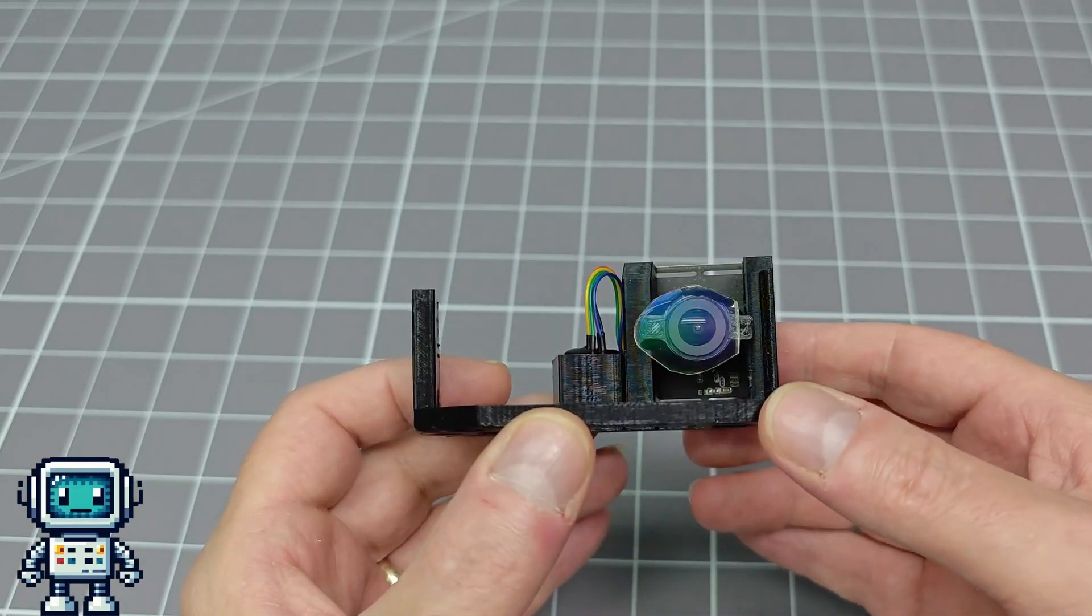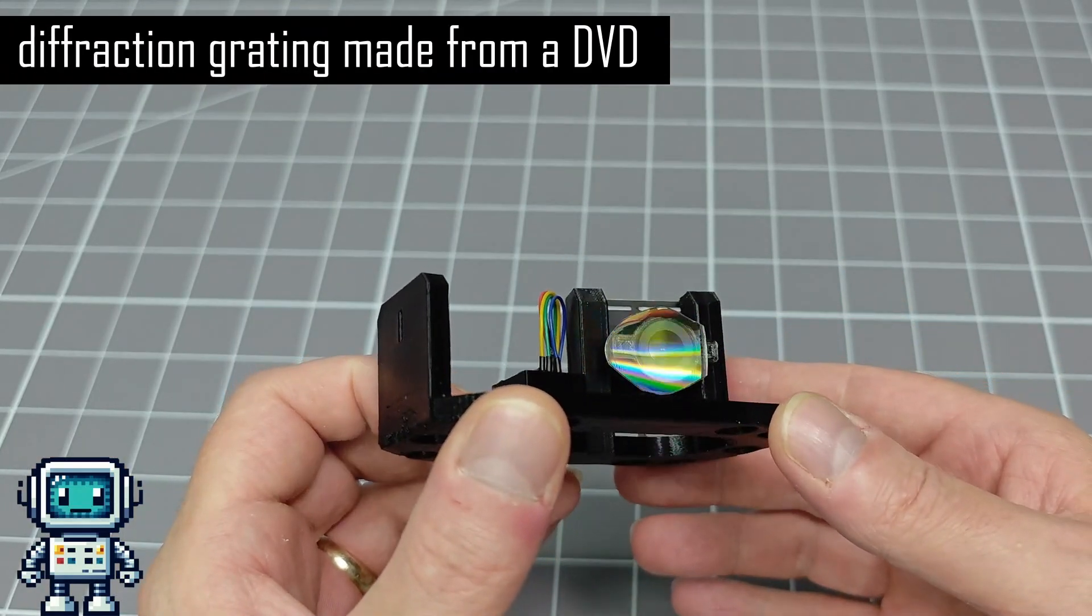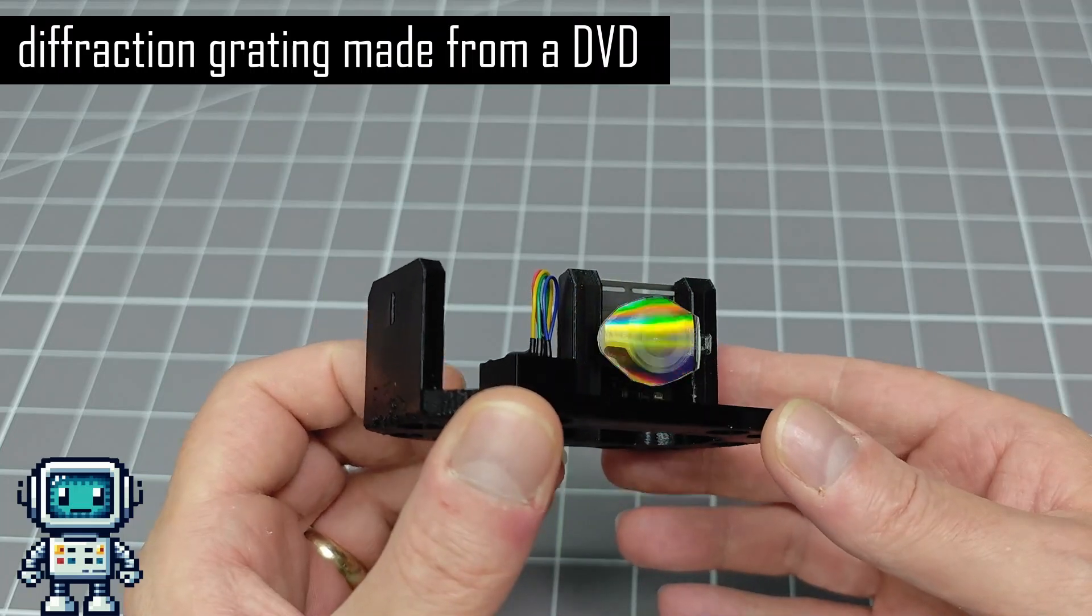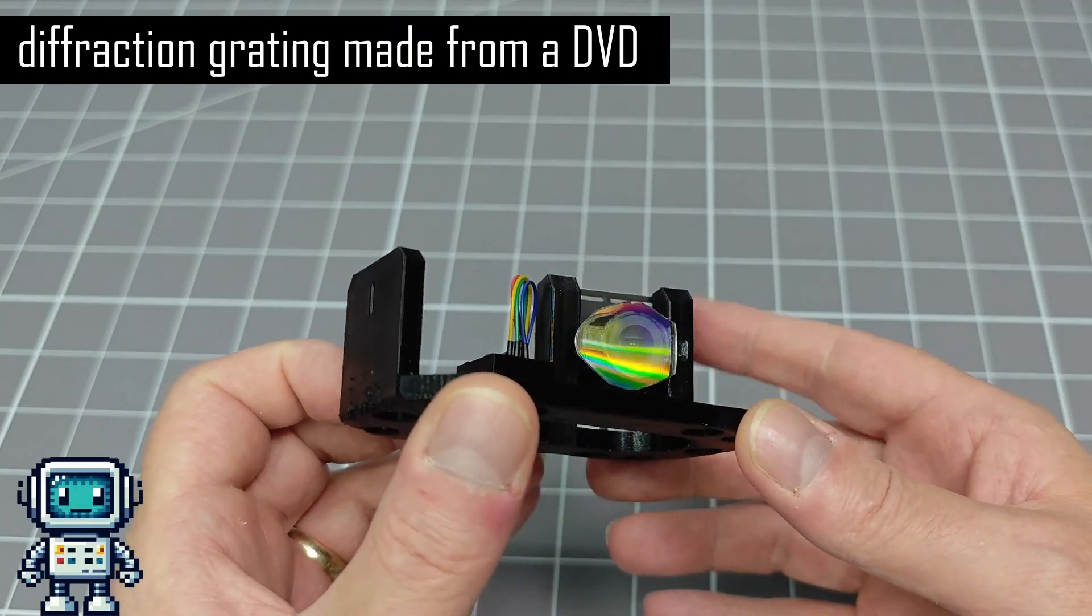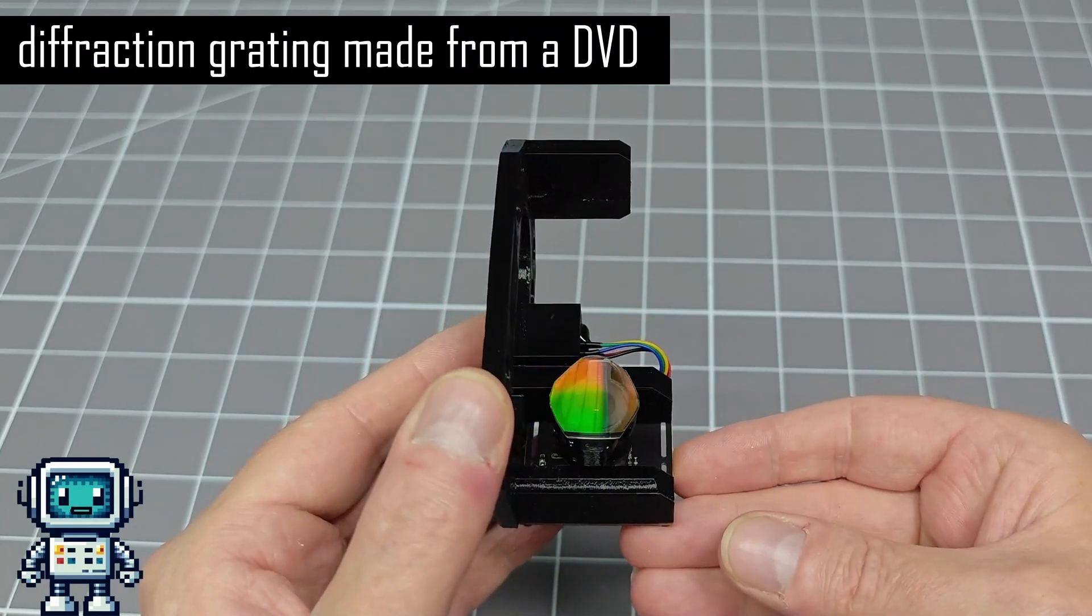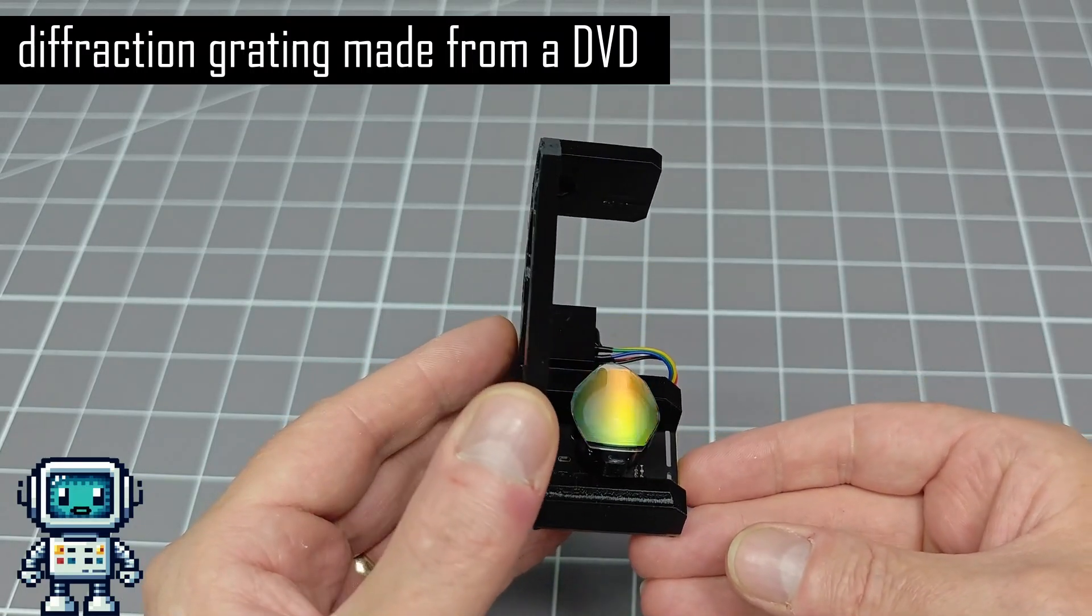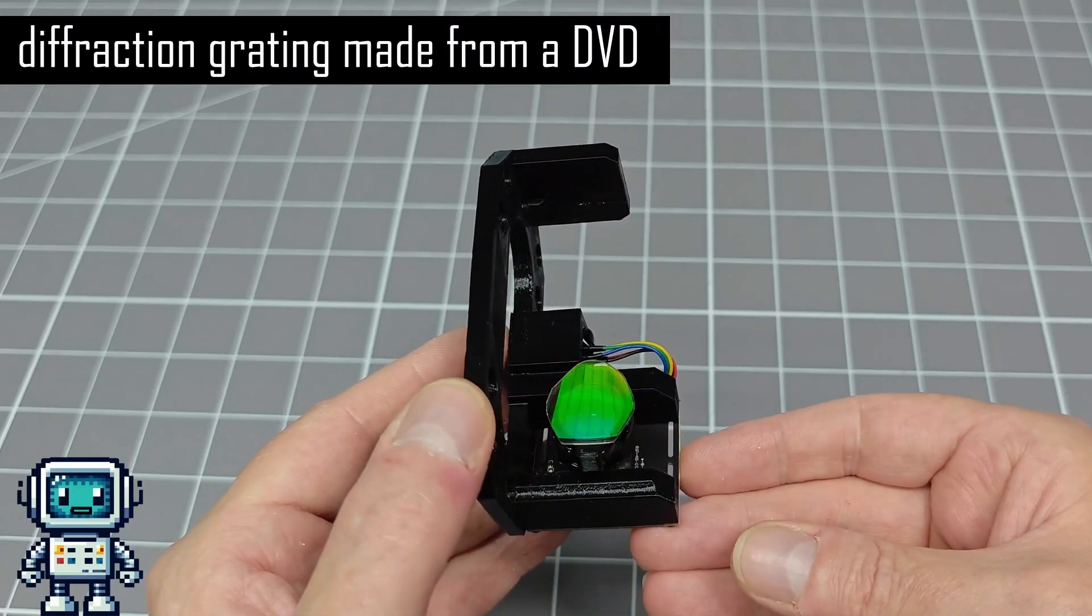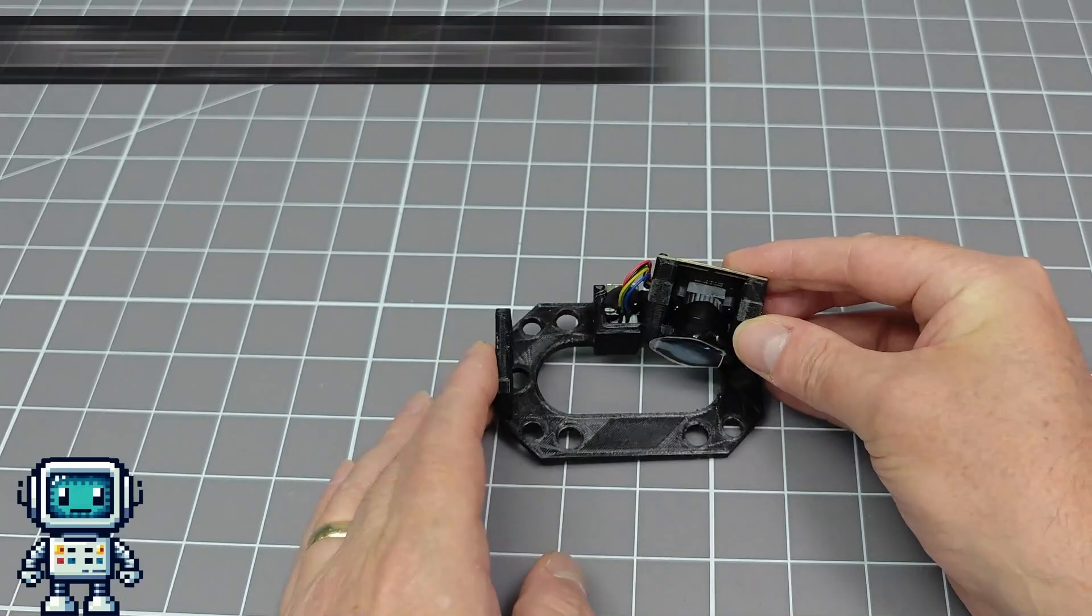You see, although this homemade product uses a DVD as the diffraction grating, this creator has refined his manufacturing methods and iterated the process over a considerable amount of time. That's why we like this little spectrometer. Frankly, this DIY device gives commercial products that cost 10 or 20 times as much a damn good run for their money.